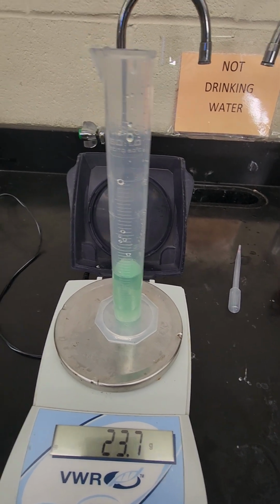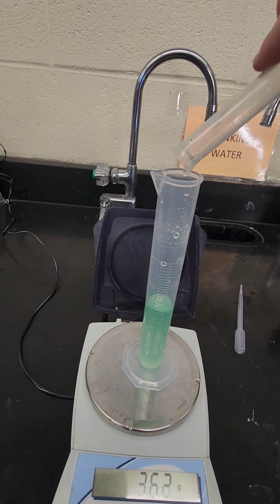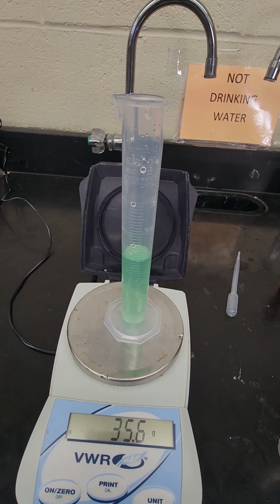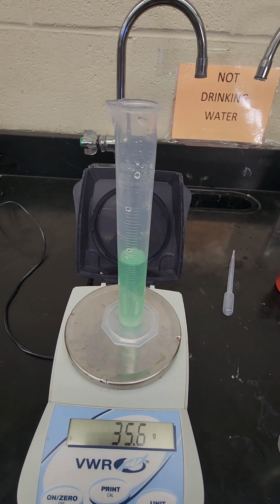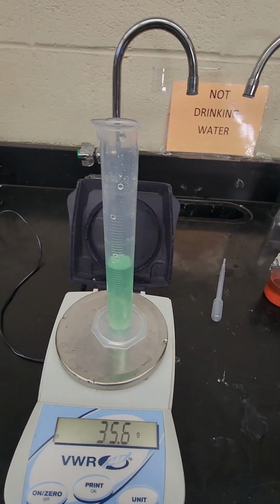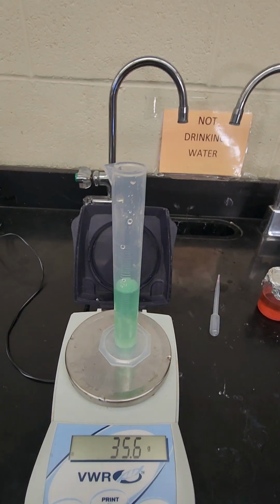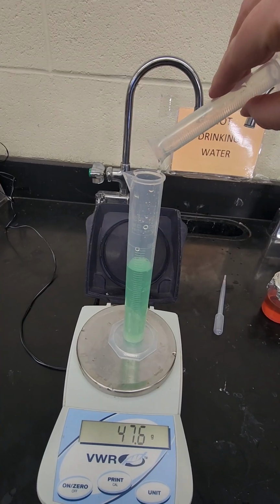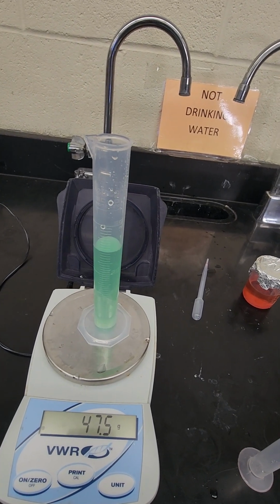I'm going to do the 30 milliliters. 30 milliliters has a mass of 35.6 grams. I'm trying to make sure this is accurate since I can't use both hands here. Okay, for 40 milliliters, the mass of the salt water is 47.5 grams.